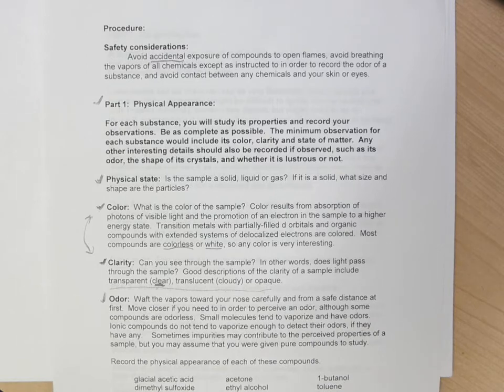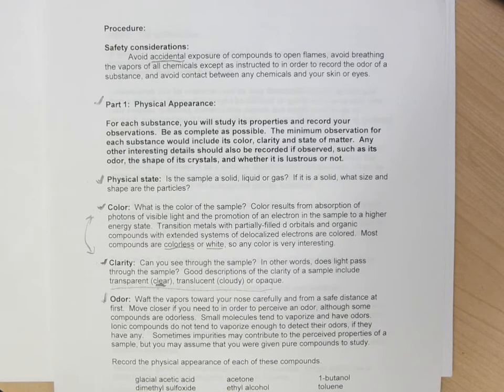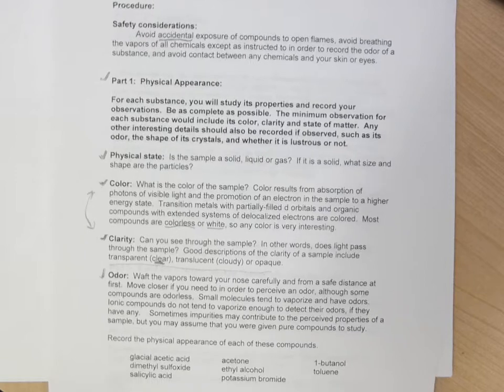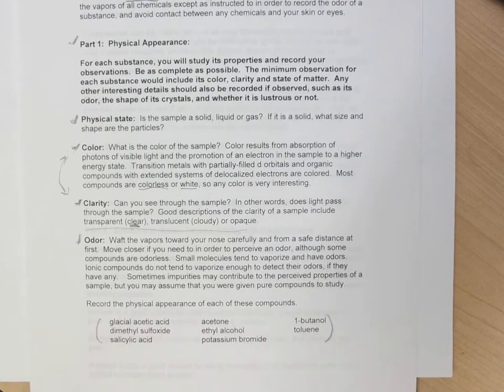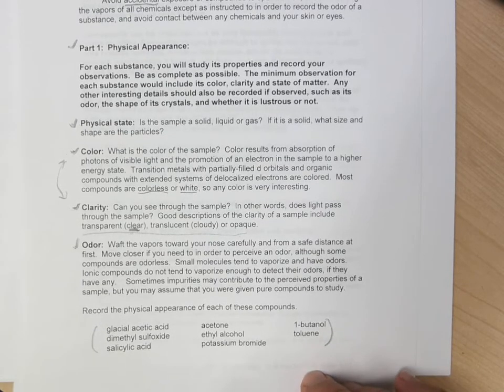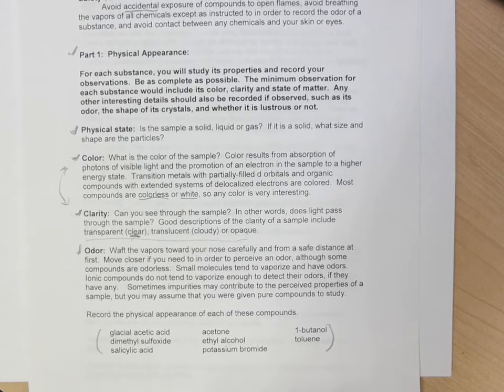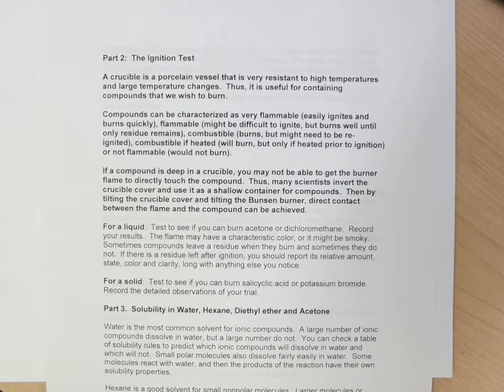So certainly if you're asked to observe a compound before or after a chemical reaction, you're going to want to list at least its physical state, color, and clarity. If there's any noticeable odor, shape to crystals, or etc., add those in. So you can see here that normally when we do this lab in person, there's 8 compounds that you observe what they look like, and most of them are clear and colorless liquids, which is very typical for good pure organic compounds.